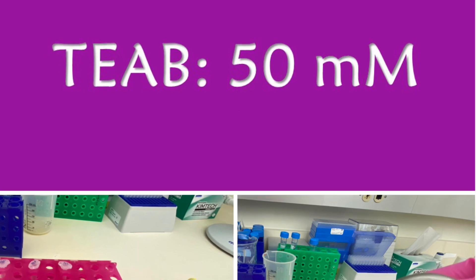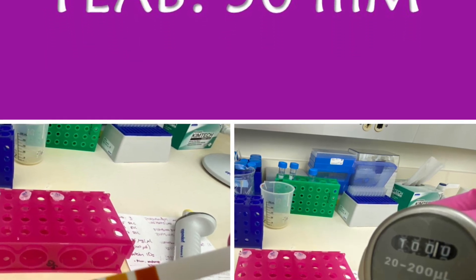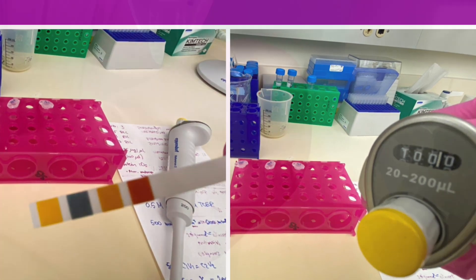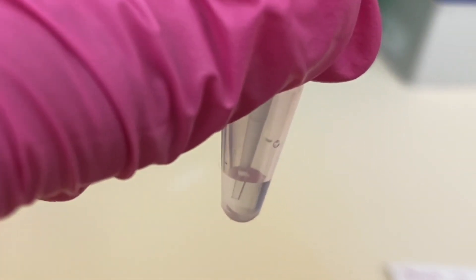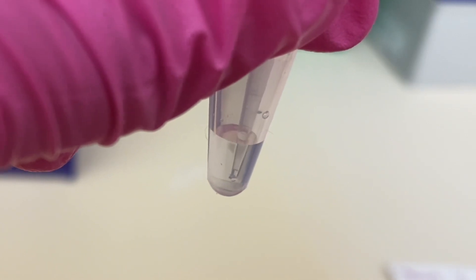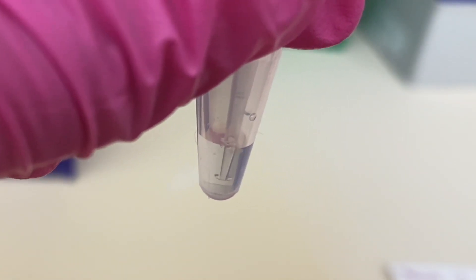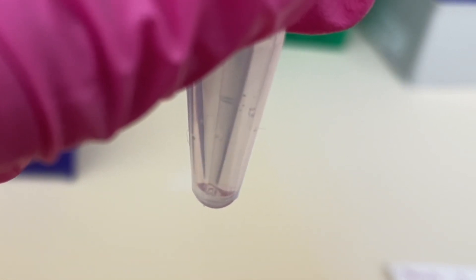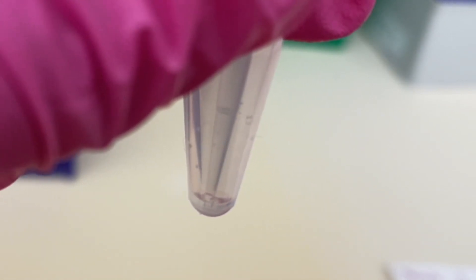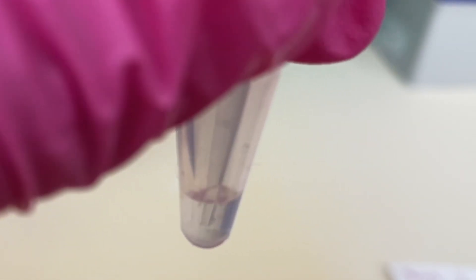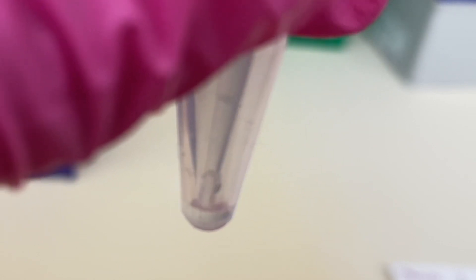Next, I will have to dissolve the protein pellet in 50 millimolar TEAB. So I will be adding 100 microliters of the buffer to my pellet. And then you can either vortex—what I like to do is just go up and down gently with the pipette—and the protein should dissolve. If they don't, don't worry. When we add trypsin in the next step and leave it on a thermomixer overnight, everything should be dissolved, so don't worry about that.